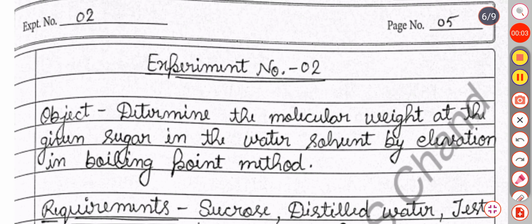In this video we will discuss the second experiment of B.Sc fourth semester. The object of this experiment is to determine the molecular weight of the given sugar in the water solvent by elevation in boiling point method. यहाँ पे हम elevation in boiling point method से sugar का molecular weight determine करेंगे किसी water solvent में.